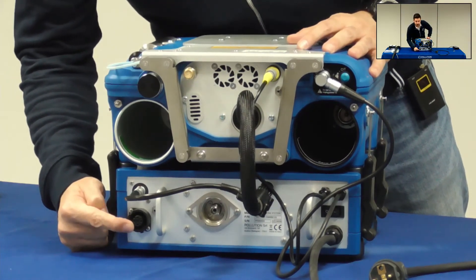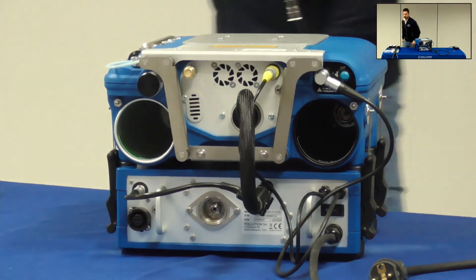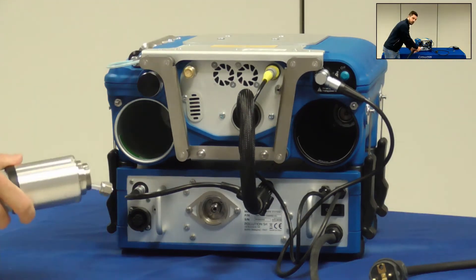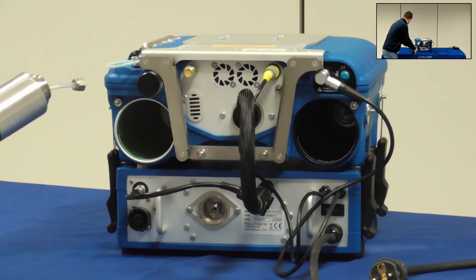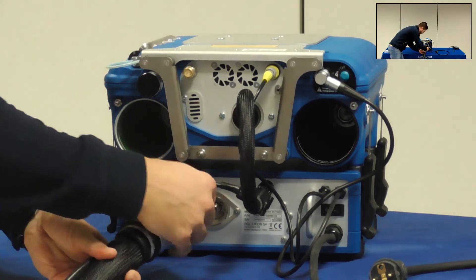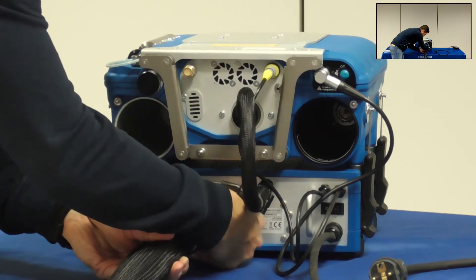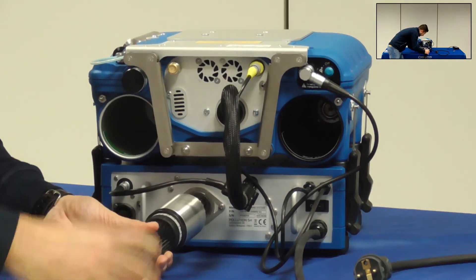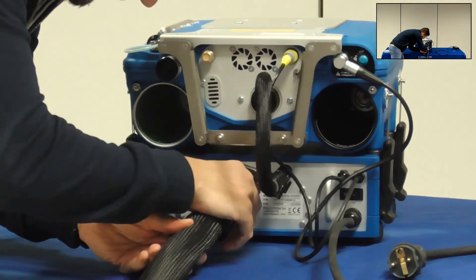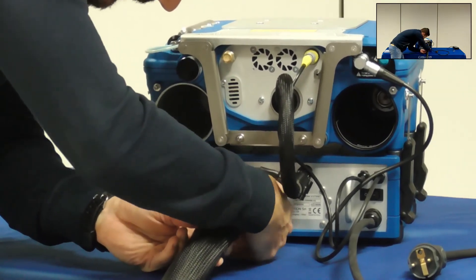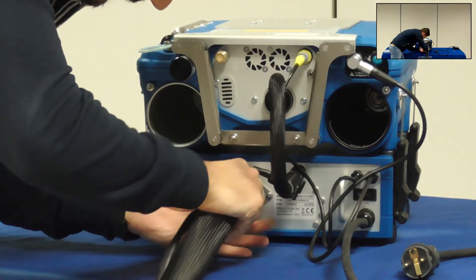Now I'll show you how to correctly connect the sampling line. First you need to screw the Swagelok connector and first the internal PFA tube, then the external metal cylinder which will protect the tube and prevent any bending or any problem.